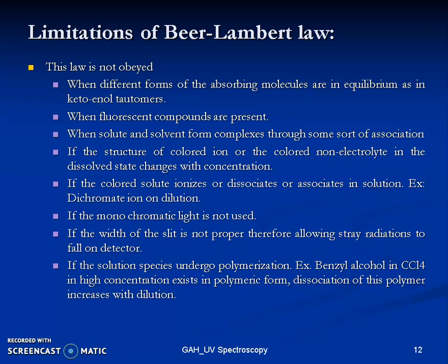So the next thing is, if the structure of the colored ion or the colored non-electrolyte in the dissolved state changes with concentration, then Beer-Lambert's law is also disobeyed. There are some compounds whose color changes with the concentration.